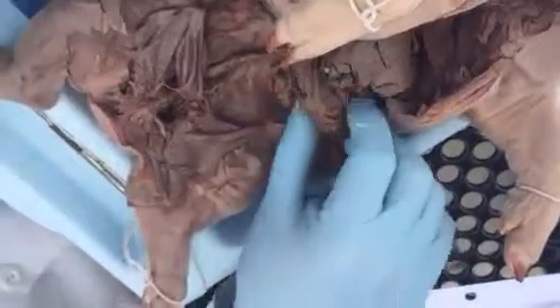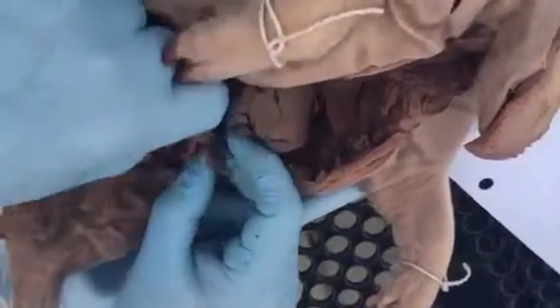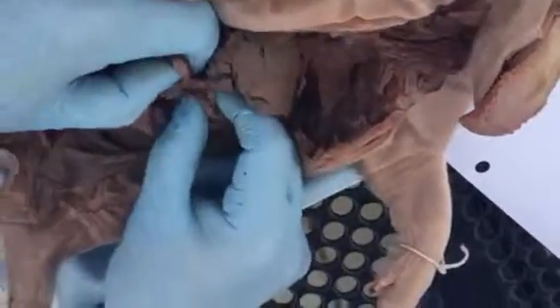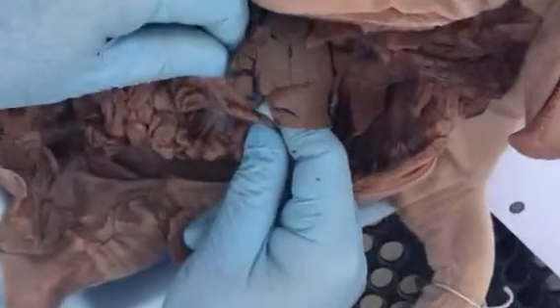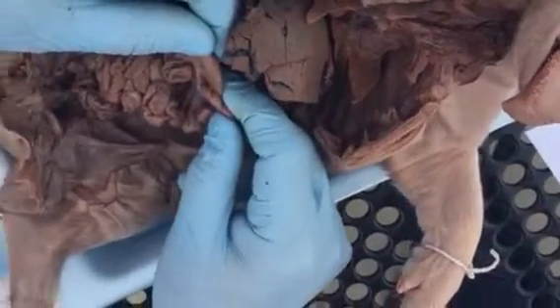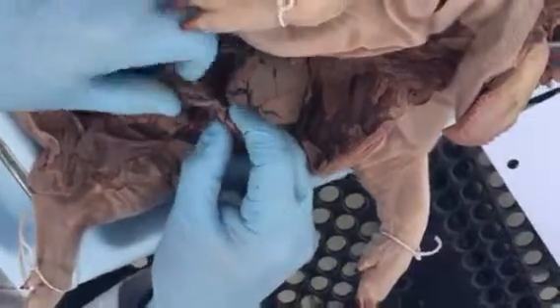Okay, mesenteries we saw in the rat. So just go up to the small intestine again, spread it out. And it holds them together? Yeah. So that's mesentery right there. And again, depending on the pig, it could be bright red, it could be blue, it could be both, it could be no color at all.